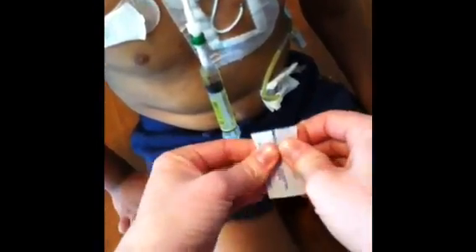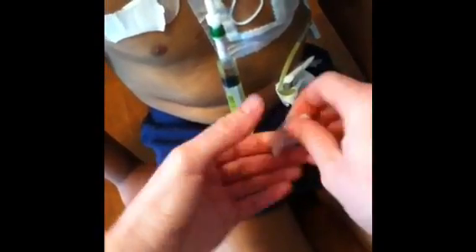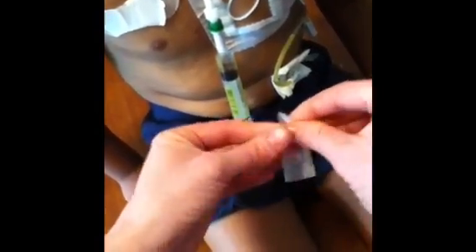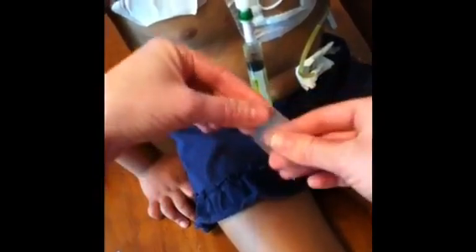We take parafilm and you just sort of tear it like this, then you can grab a hold of the paper. The paper just peels off and it is clear and it stretches. There's no adhesive so it just kind of sticks to itself. You would just wrap it like this and then as you wrap you stretch like that.